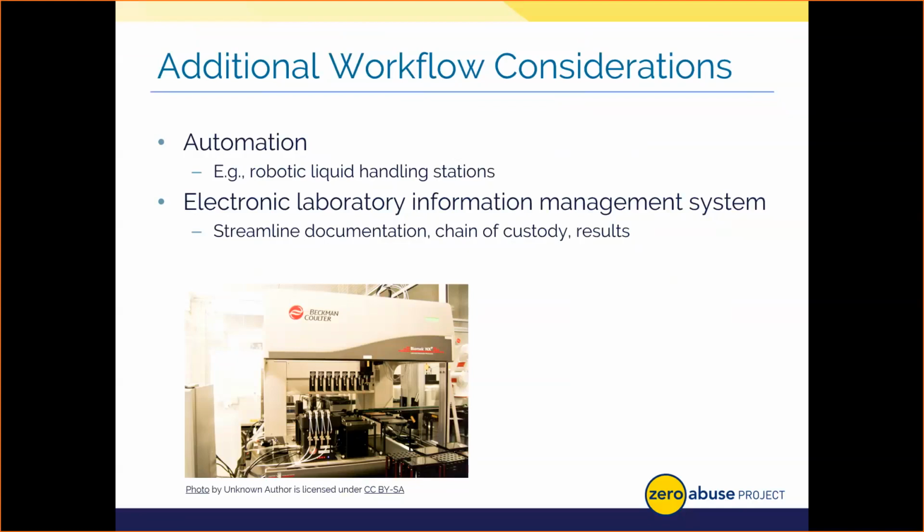We actually used one where I worked. We had RFID or barcode tags so that every time you scanned an item in or out, we could track the chain of custody and it would autofill where it could a lot of details in electronic traceable forms instead of having to by hand fill out all of those documents. So we can alleviate a lot of hassle in our laboratories if we consider automation. I did just want to bring that up.